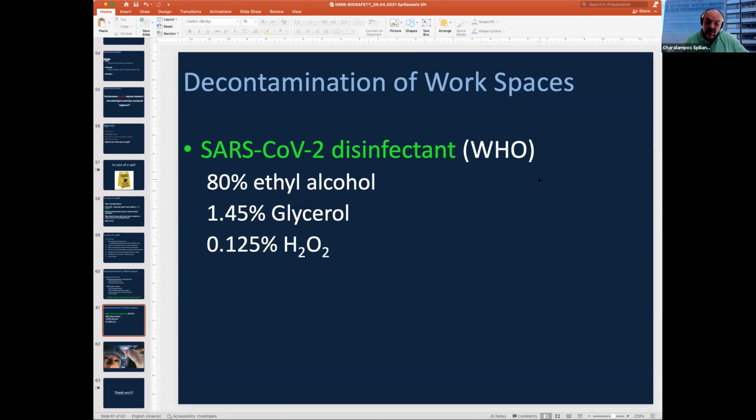Here they are blue, because these will be autoclaved before being disposed to the garbage. So they should definitely be disposed in the tissue culture rooms in the designated containers, which have blue bags, and they're next to the biosafety cabinets.